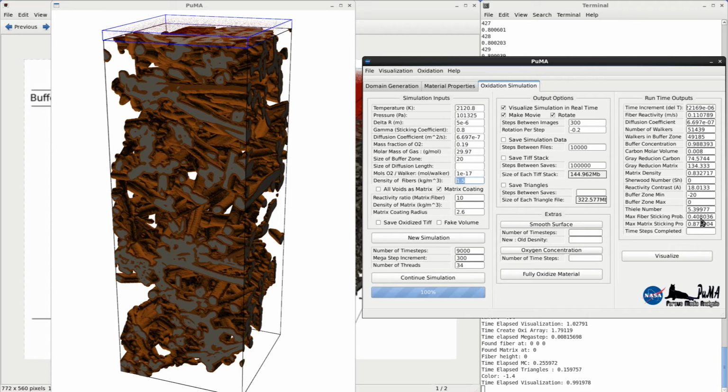to the minus 6, it means that the simulation will probably take too long to run, and you'll have to vary the initial inputs. So since in our case our grayscale reduction here is a little bit higher than we wanted it to be, we'll change this to say 5.